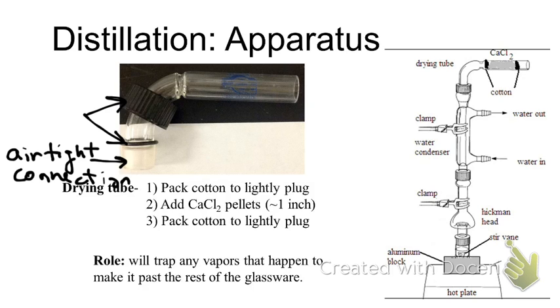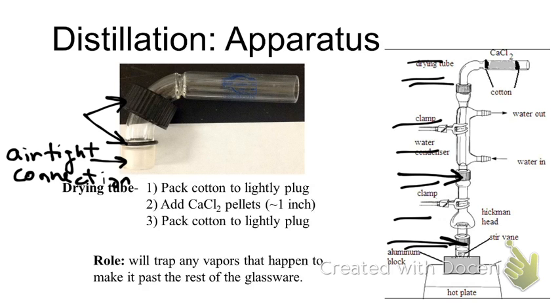However, if we look at the extended apparatus, we've got a lot of pieces of glassware all the way up there. Okay? And because each of those is an individual piece, we would have to clamp it in case we knocked it. We don't want all those things falling apart. You'll notice at each of those joints that we've got a cap. That cap is exactly what we've got over here, and underneath it you have the O-ring. And what that's there for is to actually keep glassware together.